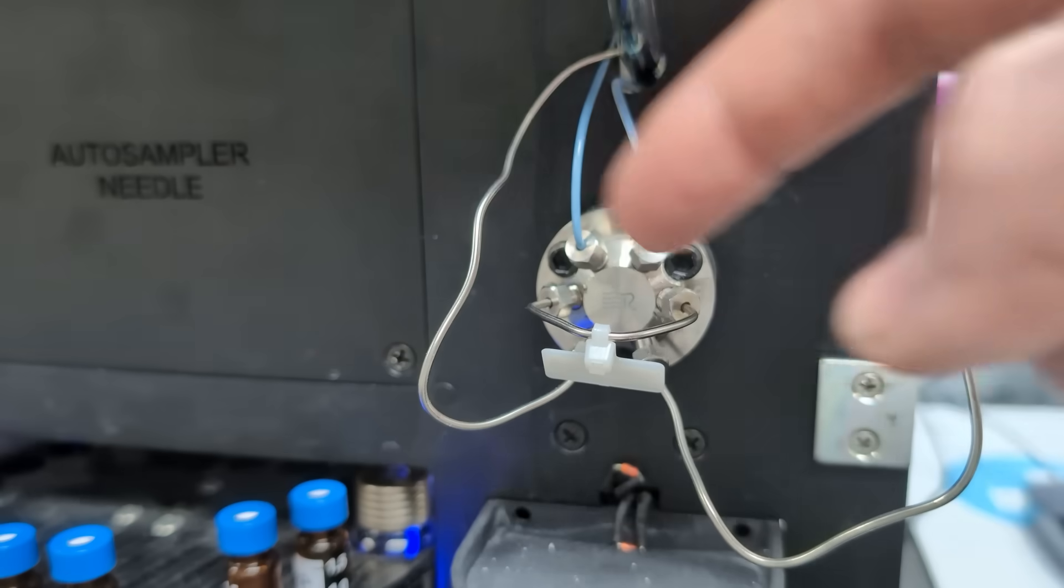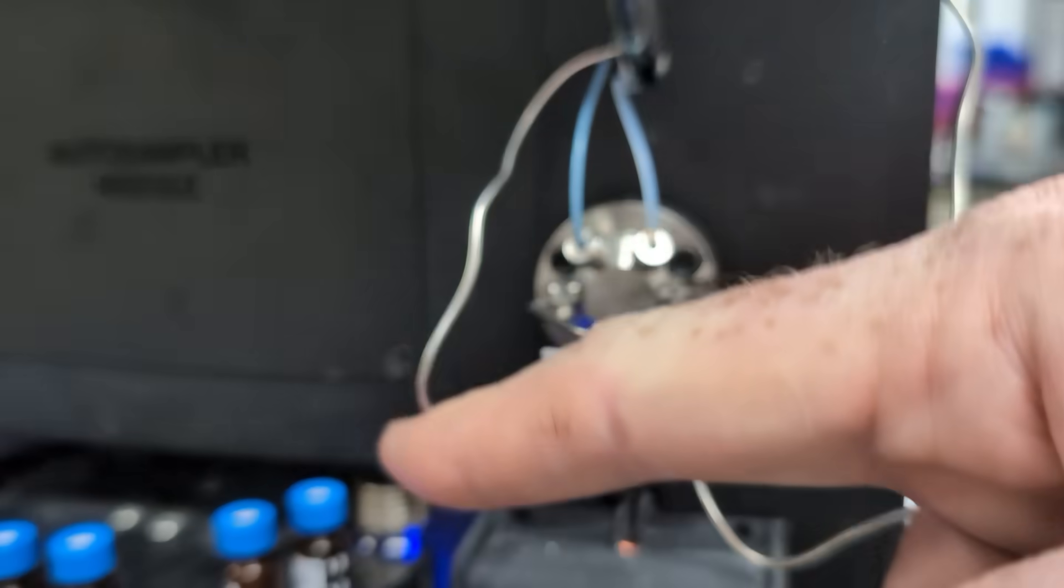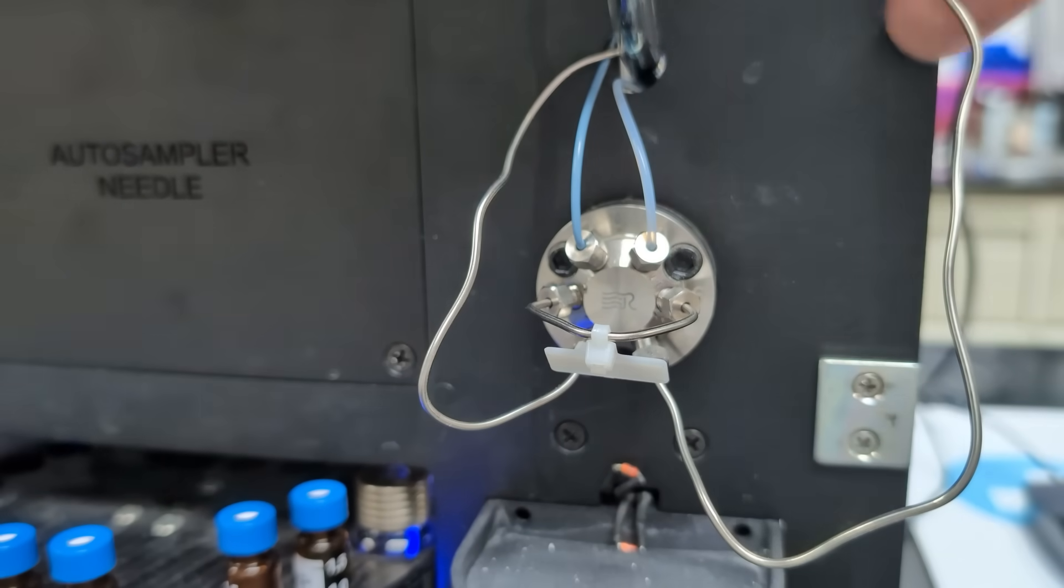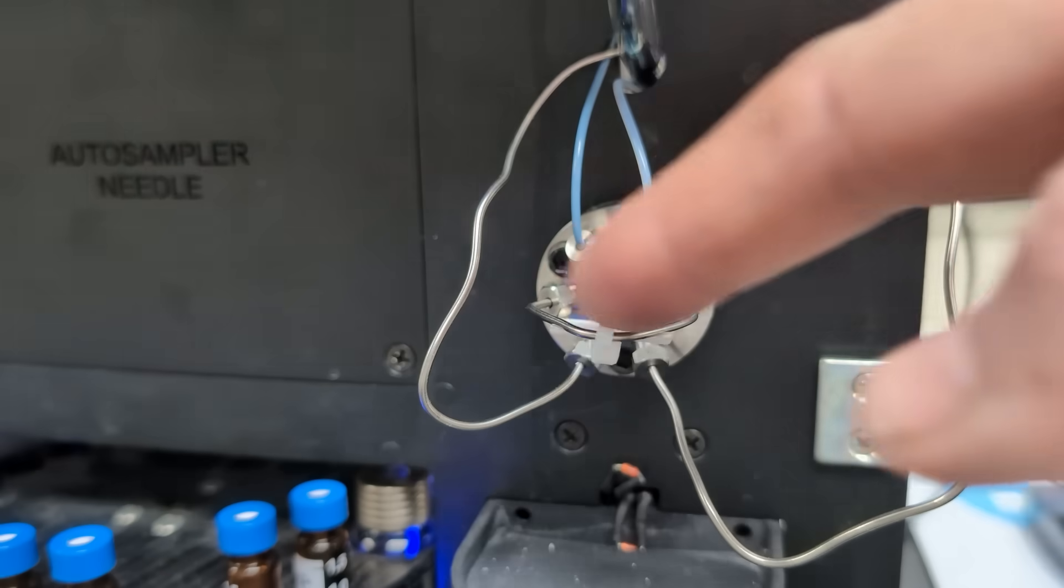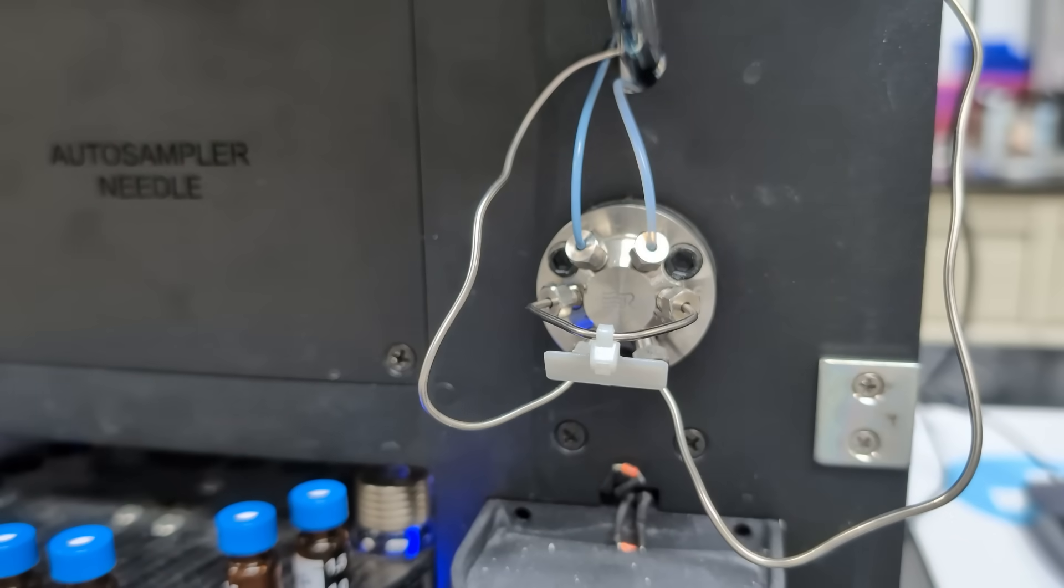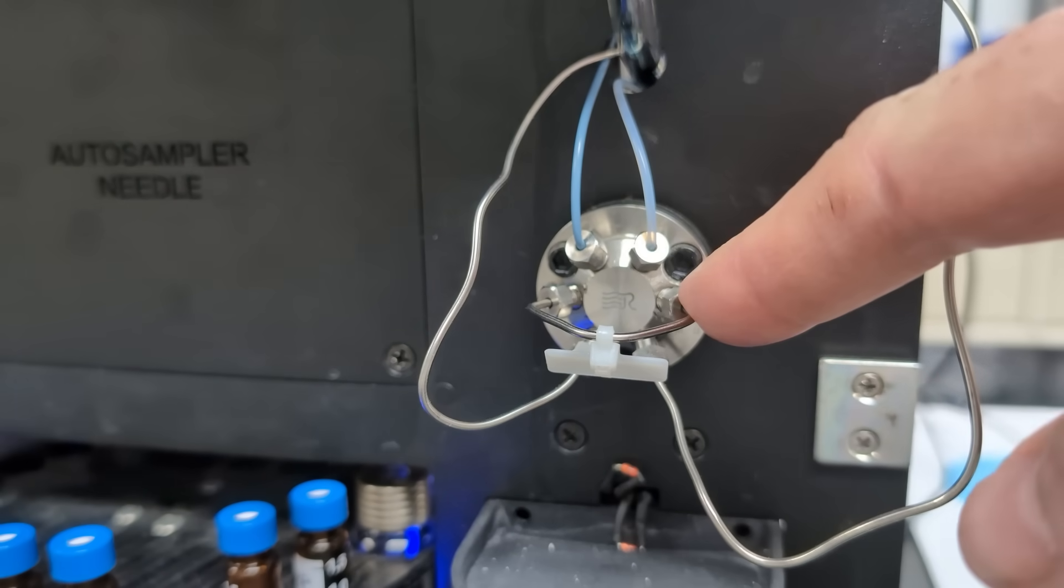If that's all connected, then the pump is connected here directly to our column, allowing mobile phase to bypass our sample loop. Once the loop is full, then our injection valve turns, and once that turns, then the needle is connected directly to our sampling syringe.